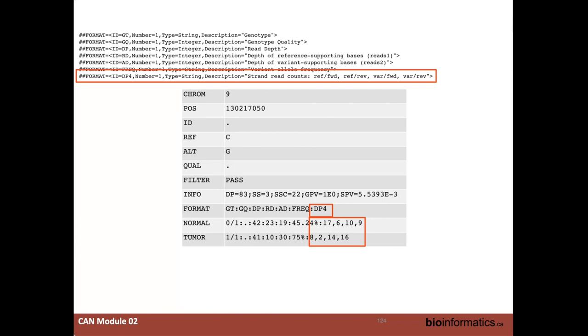If you have a read where the base quality is really bad, so it's not sure it's actually that base, you don't want to consider that base for mutation calling. So it gets thrown out. So you have your read depth minus all these reads that didn't pass those filters. And you can change the parameters to control what you're comfortable including or excluding. I've sometimes seen it be half in certain positions, right? Only half the reads are used. It really depends where you are in the genome. Yeah, I've encountered that where it's down to half or even a quarter of the one that you're expecting. Did I answer your question?